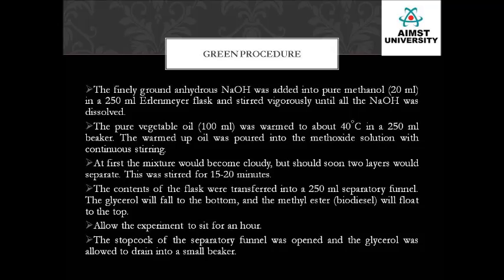At first, the mixture would become cloudy, but soon 2 layers will be separating out. This was stirred for 15 to 20 minutes. The contents of the flask were transferred into a separating funnel and the mixture will be separated into 2 layers. The glycerol will fall at the bottom and the methyl ester, that is nothing but biodiesel, will float at the top. Allow the experiment to sit for an hour.